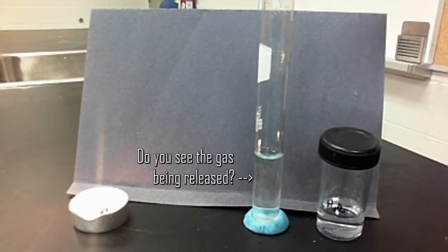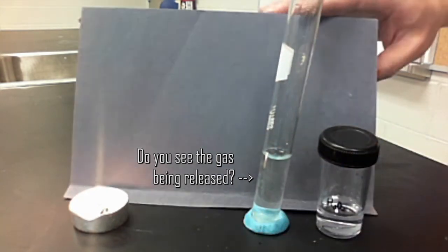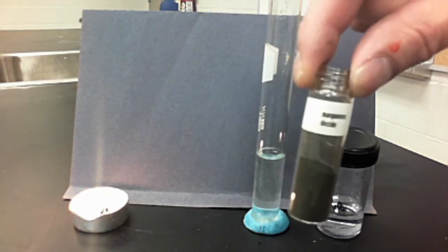It will take a while — probably the entire weekend for all of this hydrogen peroxide to break down to something you can drink. But we don't have all that time, so to speed things up we need something called a catalyst. A catalyst speeds up a chemical reaction, and the catalyst we're using today is manganese dioxide.